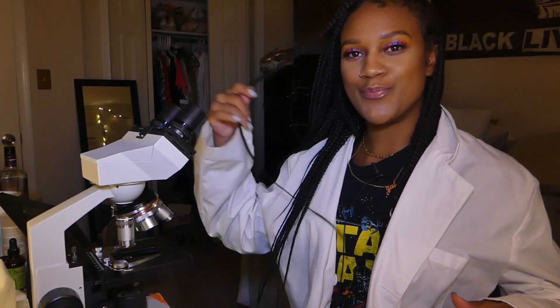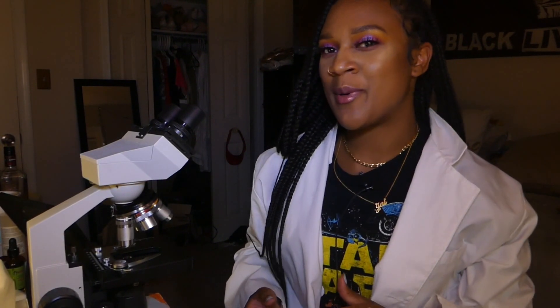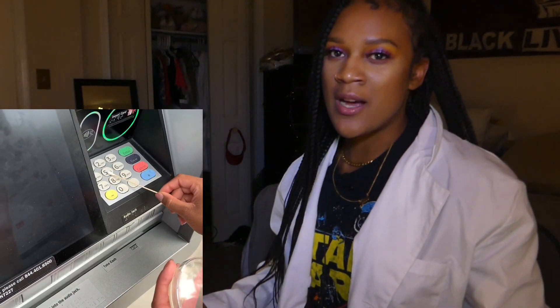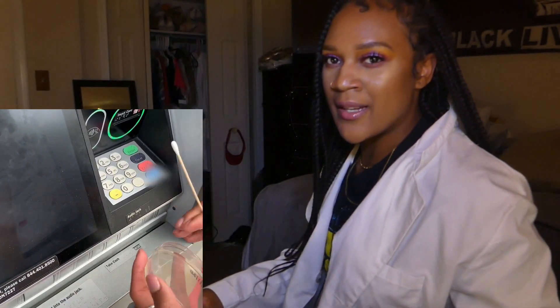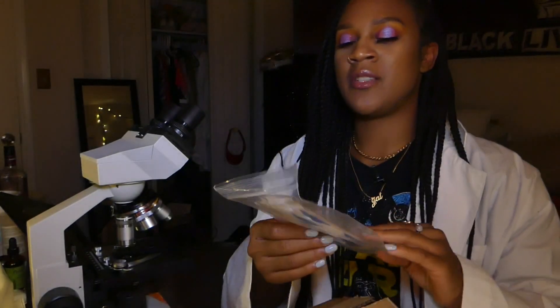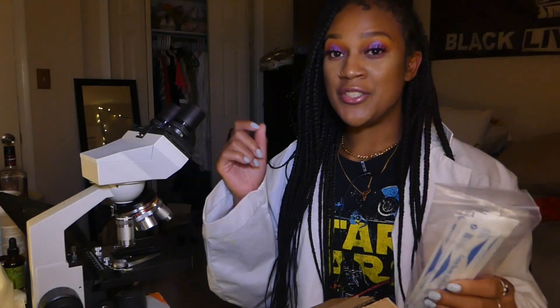Hey guys, welcome back to Micro J where we do all things microbiology. Today we're going to see how clean your everyday items are. I have these agar plates that allow bacteria to grow and flourish and multiply. The things that I swabbed were the bank keypad, the grocery cart, the gas pump, and a toddler's hand. For streaking on the agar plate, you use these sterile long Q-tips.